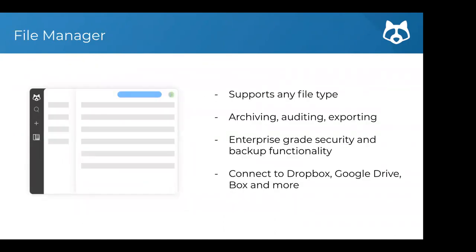The file manager is really where everything happens. All your protocols will be stored here along with experiment records and everything else. You can also add any other file type — spreadsheets, presentations, images — anything you might need to share with your team in the workspace. The file manager lets you structure everything the way you want, and allows you to share, run, edit protocols, archive things, and audit and export as well.